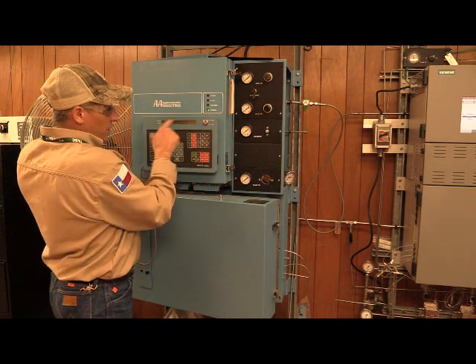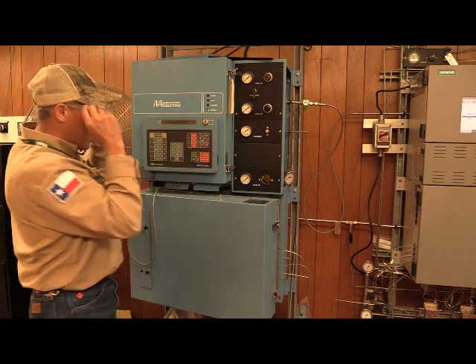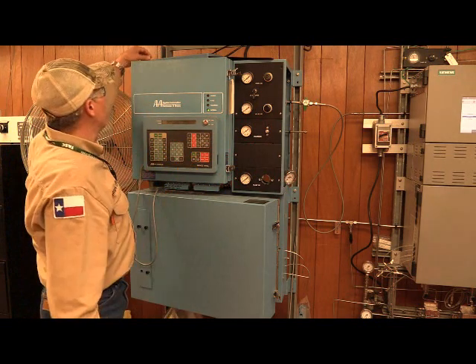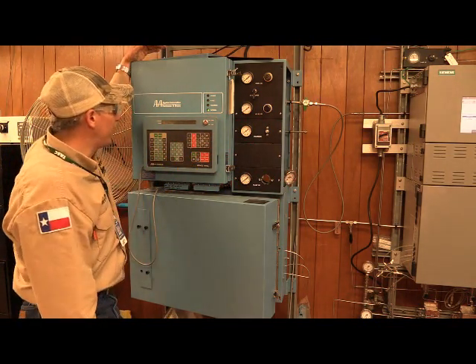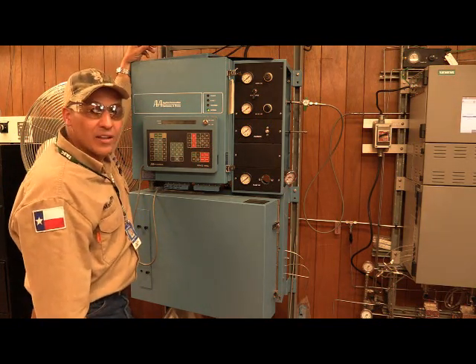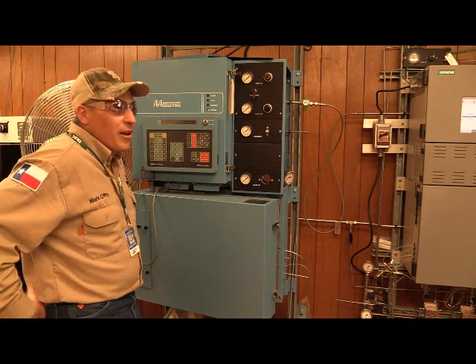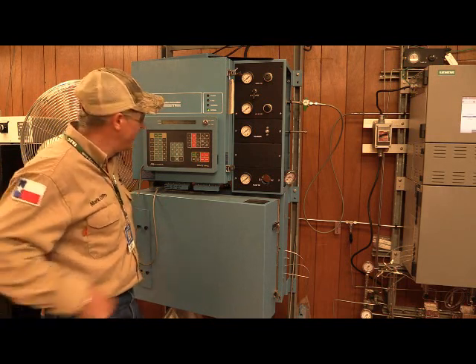If you're not able to see the screen very well, there's a knob. You use the knob so that you can see exactly what we are supposed to be reading there. You'll see analyzer technicians hitting buttons, and you're like, I don't know what they're hitting, I don't know what they're doing, but it looks like a good job that makes a lot of money. Well, it is. And probably a whole bunch of y'all are thinking, I want to go into analyzers just for the money. Well, actually, it's way better than just the money.